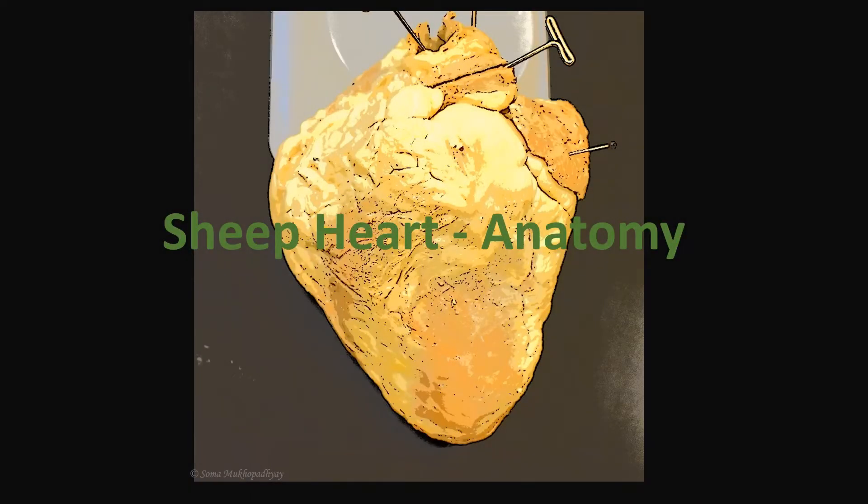In this video, we will look at the sheep heart anatomy. First, we will start with the external view, then we will go to the internal view with different structures and layers, and then we will talk about the blood vessels.